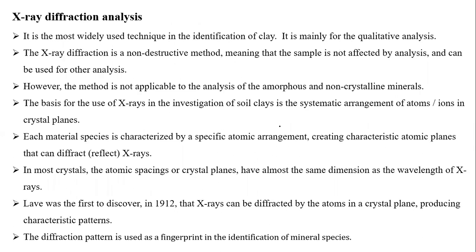Now we will see X-ray diffraction analysis. This is very good, one of the excellent, unique techniques used in the identification of clay minerals. It gives a qualitative analysis, showing how good the material is. It is a non-destructive method, meaning we can use the sample again and again. Once we have used a sample for X-ray diffraction, we can use it for another analysis also. However, the major disadvantage of this analysis is that it can't be used for amorphous and non-crystalline structures.